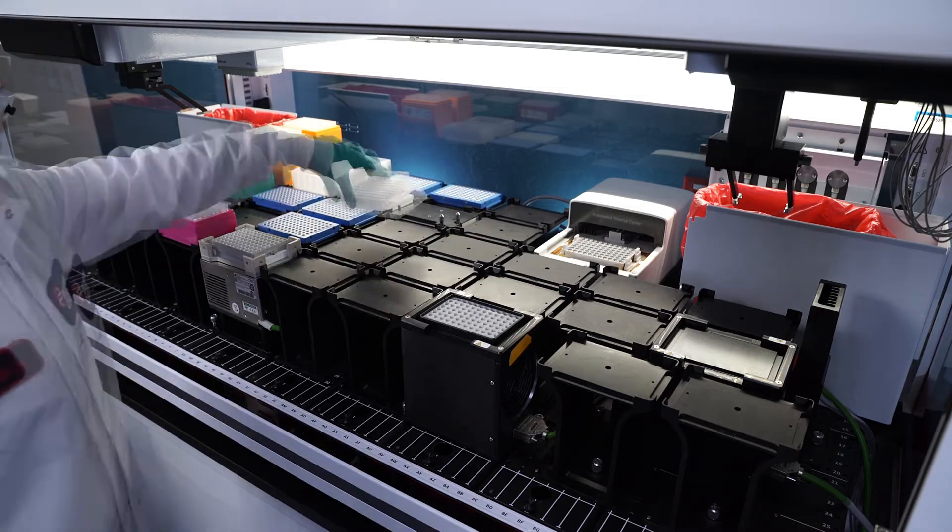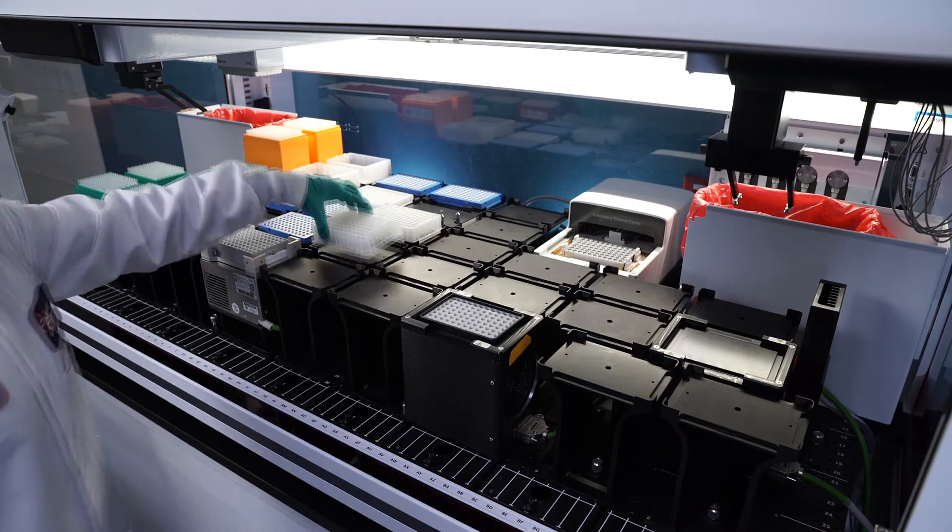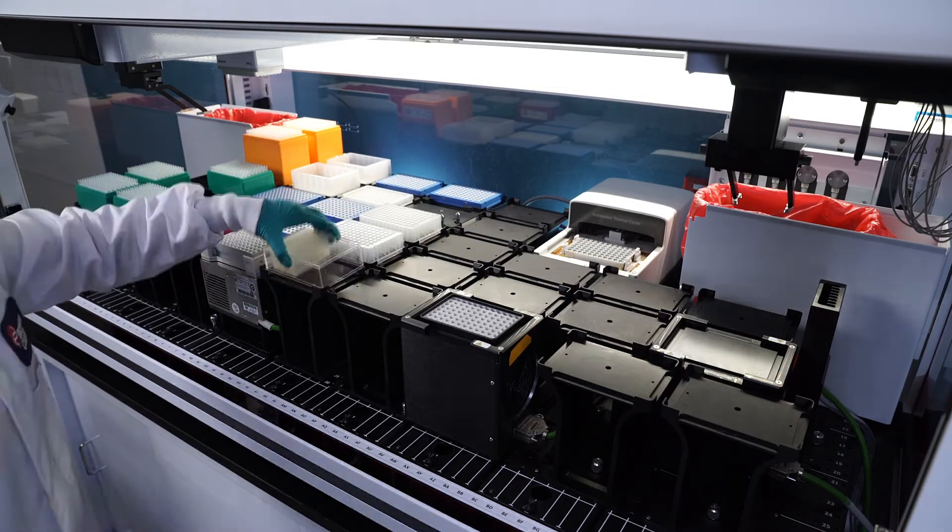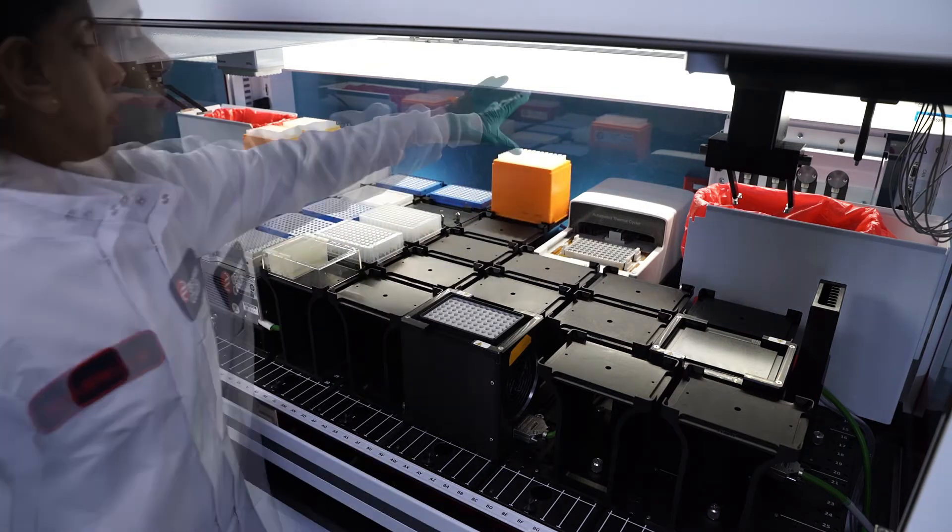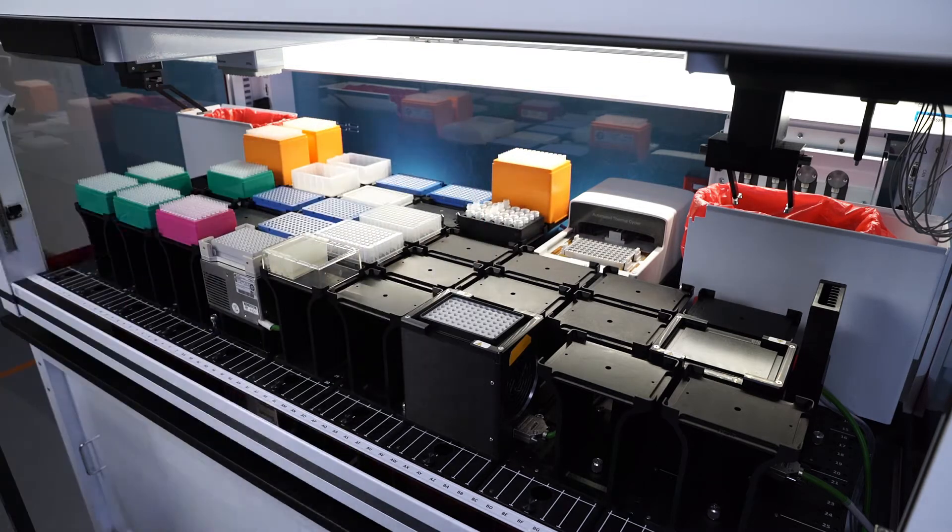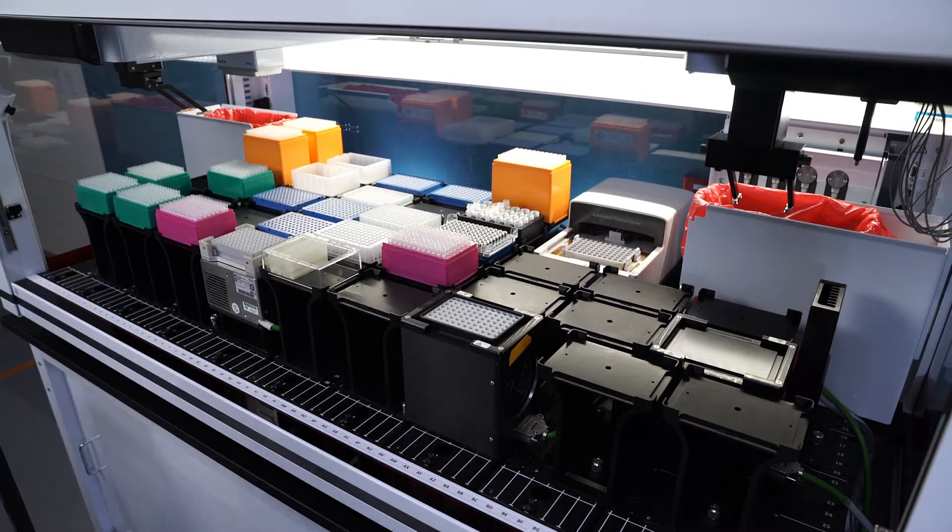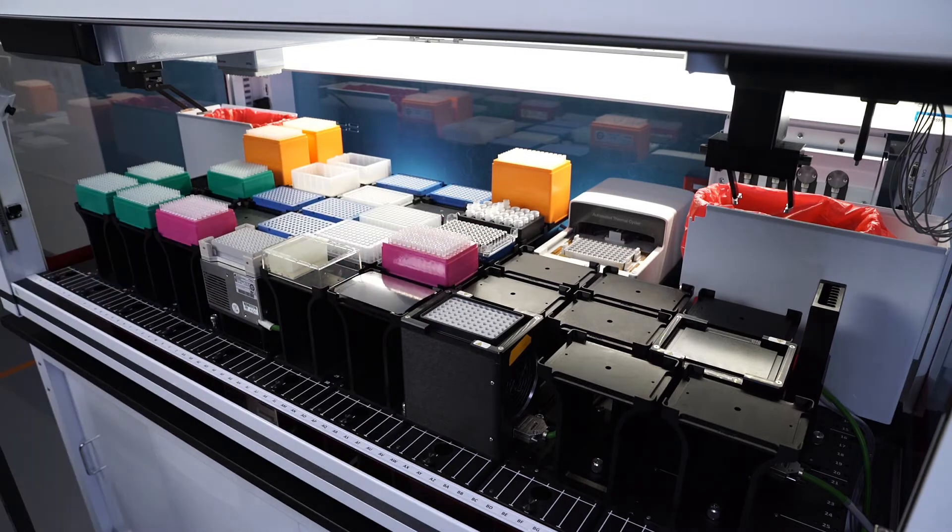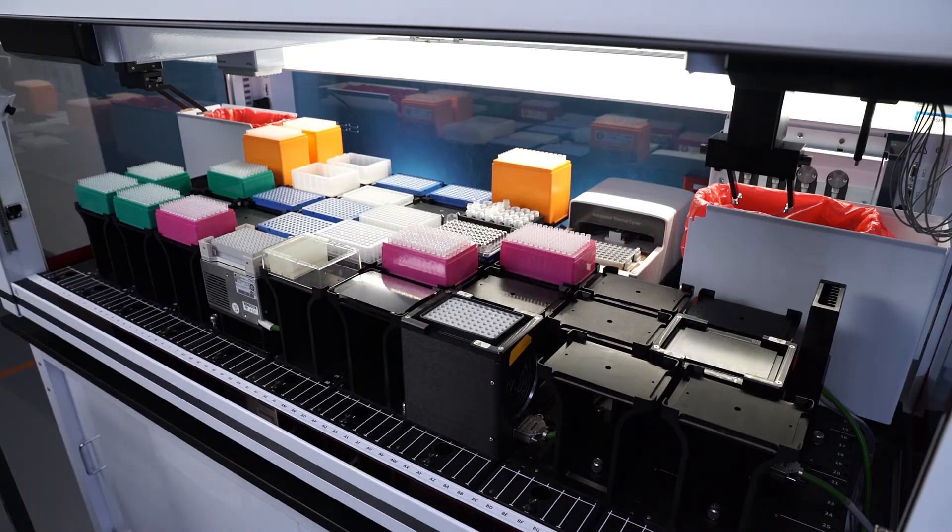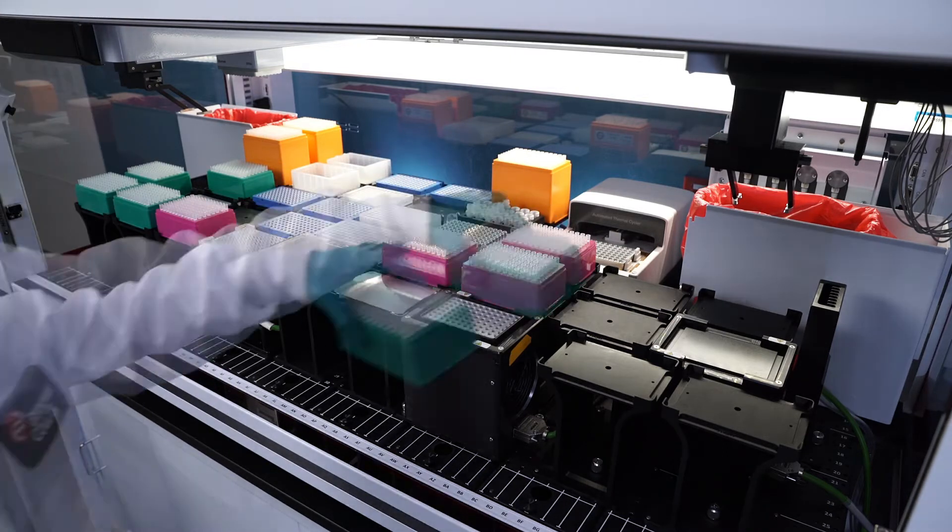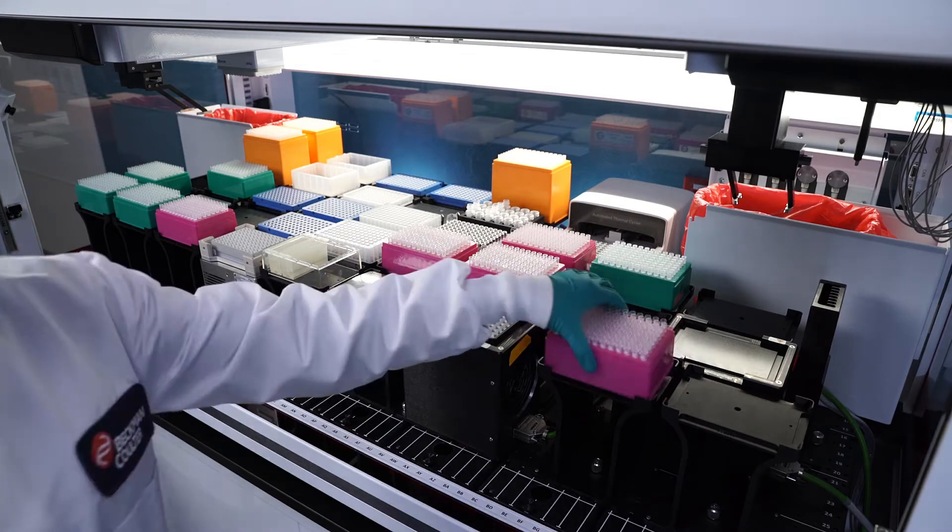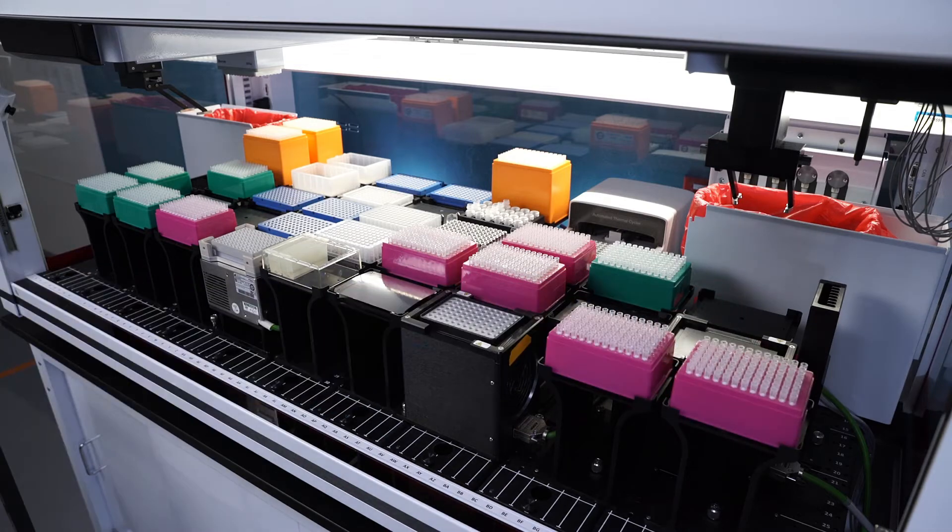Common mistakes like forgetting to load a plate or placing it in the wrong location or loading the wrong tip type on deck may lead to unplanned downtime, costing you time, money, and possibly compromising your valuable samples.